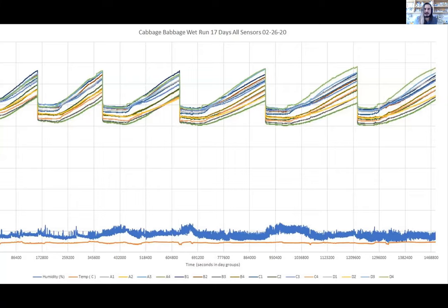The sensors need a little bit of calibration because each one has a particular offset because of the manufacturing faults of these cheap sensors. So you have to adjust them in post. You can subtract or add to it, essentially average it, and then remove the signal from it so that you can calibrate all of them to a particular standard. Every single plant will have a slightly different calibration offset, which you can then utilize. And you can even see that the curves of some of them don't overlap. Because of random variations within the soil, because the soil I'm using is complex media, really bulky, the humidity varies pretty significantly. So sometimes you actually see strange effects, but it's not because of the sensor itself, it's because the actual soil is retaining moisture in a different way.